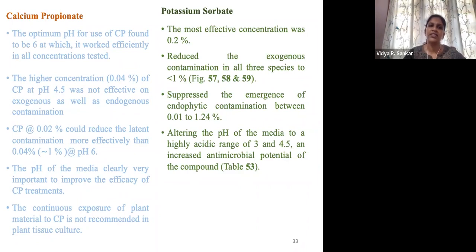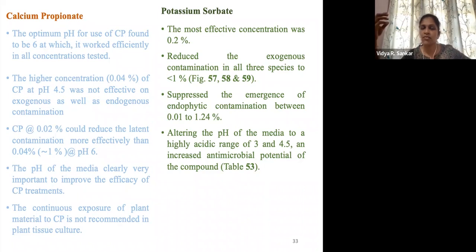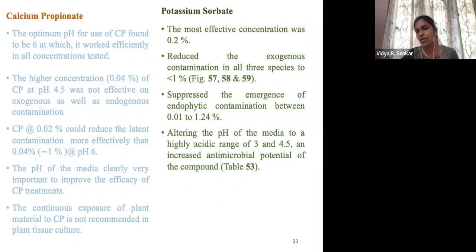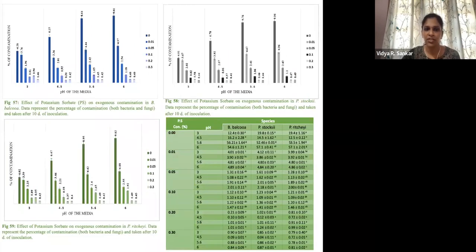Other organics such as calcium propanoate and potassium sorbate are also used for controlling contamination. We recommend calcium propanoate because it can reduce latent contamination very effectively at a very low concentration of 0.02%. It delayed the expression of latent contamination after 80 to 90 days of culture. Potassium sorbate is also very good for exogenous contamination, but for better performance it requires a pH range of 3 to 4.5.